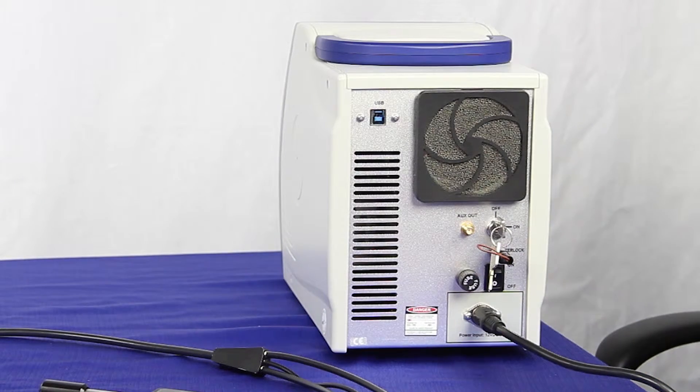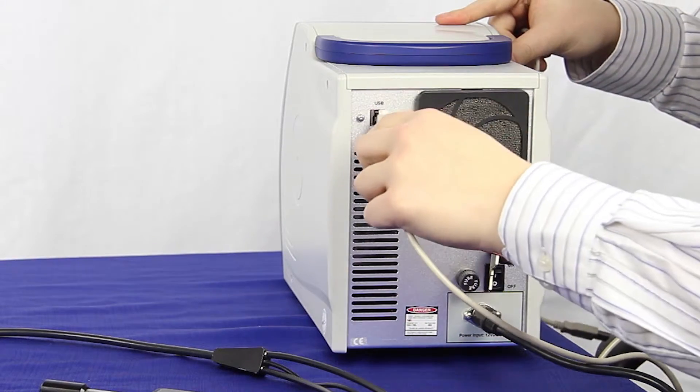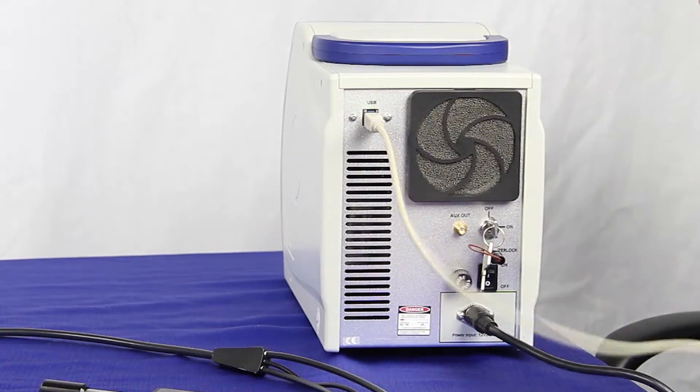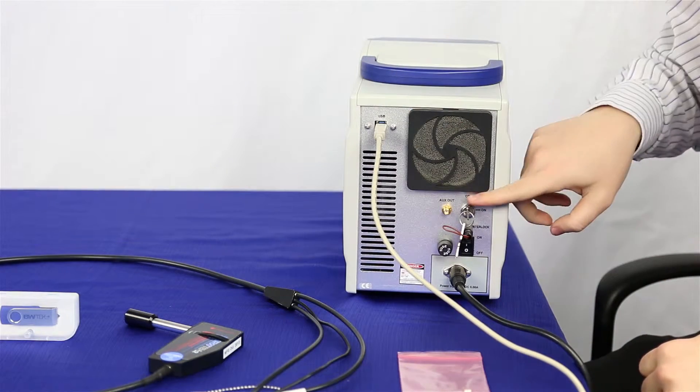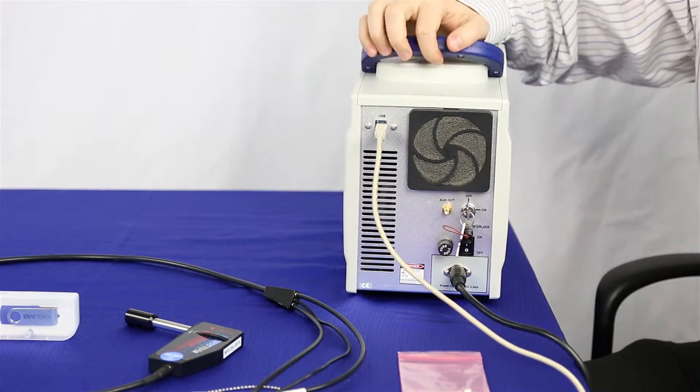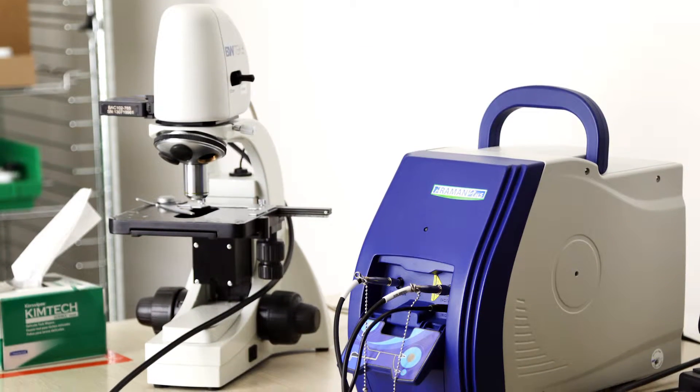You're also going to take your USB cord and plug it into the USB hole here. On the back, you'll also see there's an auxiliary port. This is for the BAC-151B microscope should you purchase one.